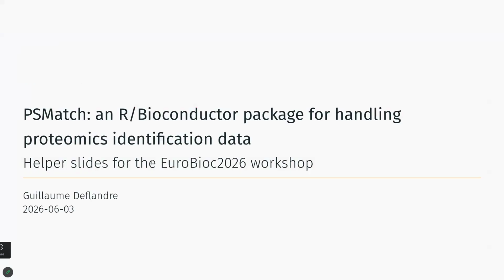Guillaume is a PhD student in the computational biology lab at the Duve Institute in Brussels. His PhD focuses on identification of specifically single-cell proteomics data, because these mass spec data have specific characteristics, and maybe the tools that we use for bulk are not ideally suited for that.